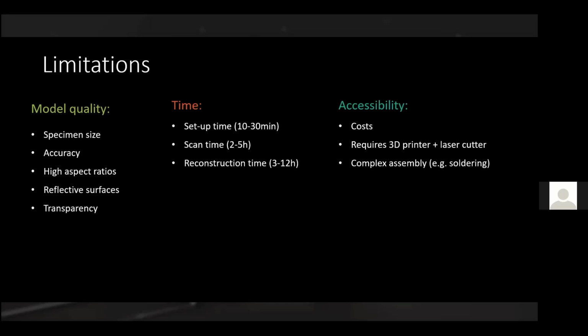And then last but not least, if you want to build the device yourself, and some people have, I think we're now at maybe 6 rebuilds or something? So there's 4 published on Sketchfab, but far more from people that have just community-wise rebuilt it. So of the order between 5 and 10, say. Some people have already built it, but these are keen builders that have some previous experience. I'm not sure, maybe some are even here in the call, but you still need to solder, you still need to figure out how to put these things together. So there's still a bit of effort required to actually build this device yourself, although all the needed information is in principle available.